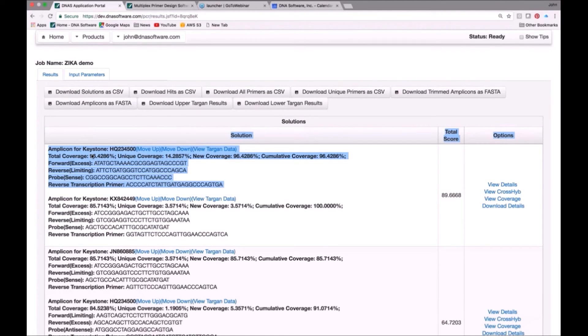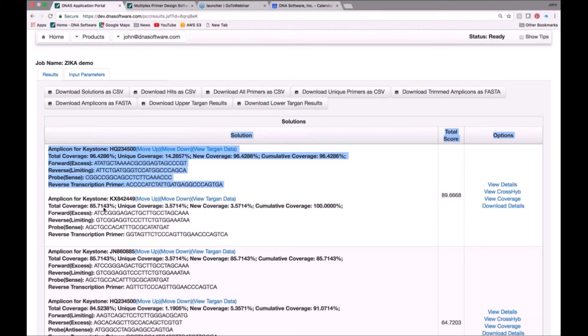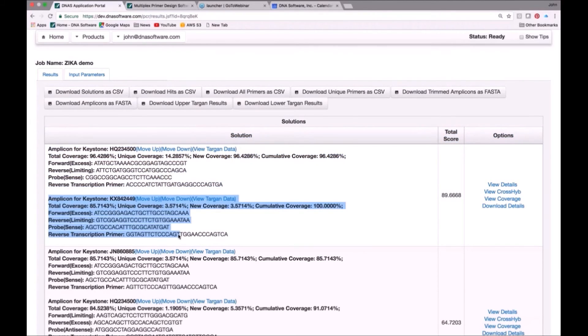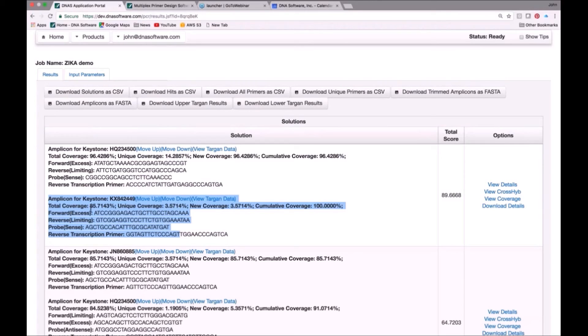And what you can see now is the second set of primers took the cumulative coverage from 96% to 100%. So the second set of primers, shown here, by themselves, that set of primers covered 85% of the Zika virus genomes. But together, the two primers together, have been designed to not interfere with each other and to completely solve the problem and have a cumulative coverage of 100%.